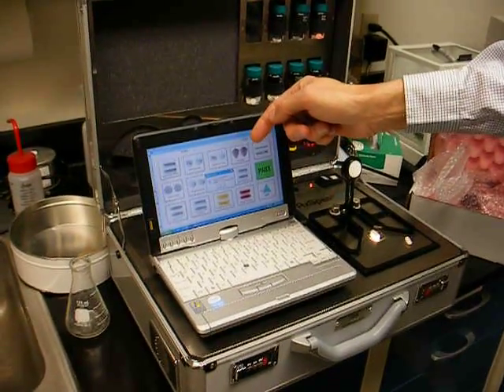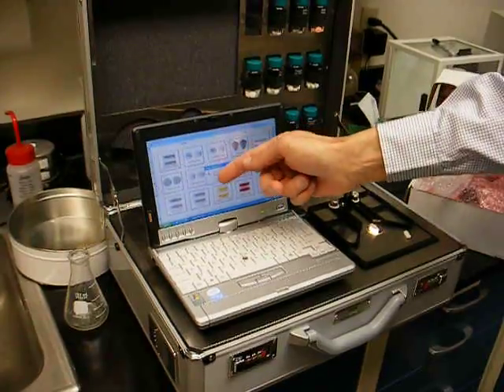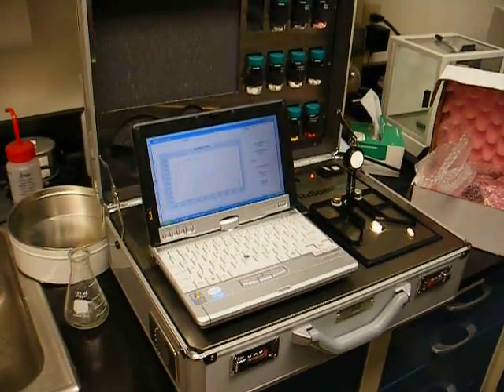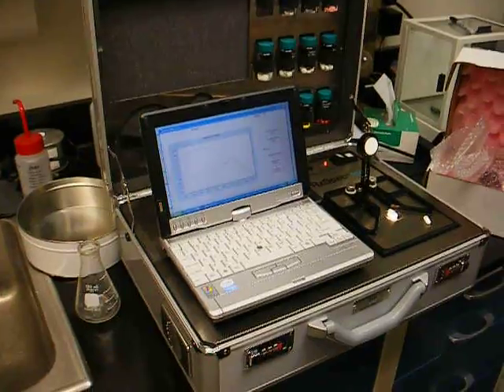Also, we can see the spectra associated with that particular sample.